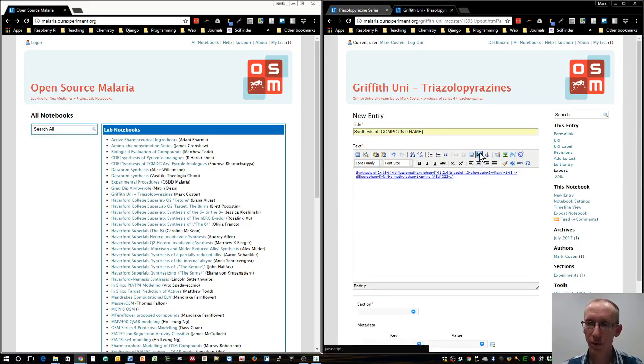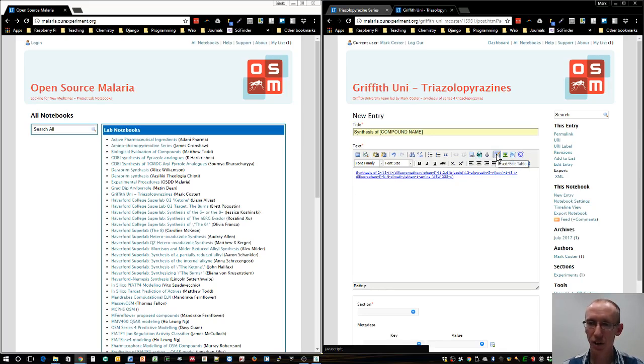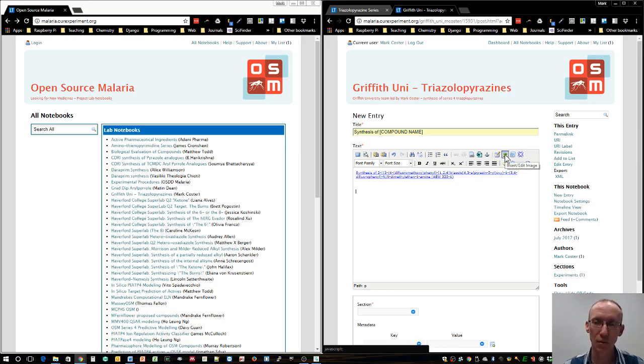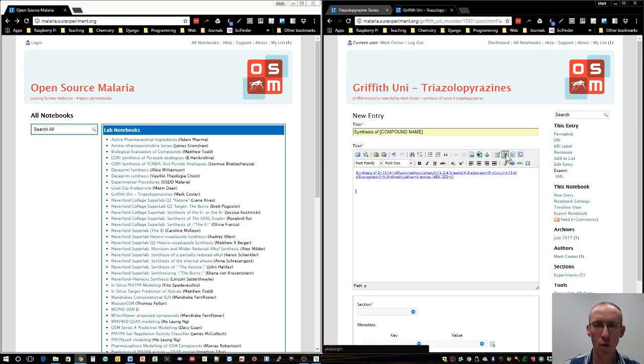You can also insert a data file embedded within your entry. You can insert a table, there's limited functionality here, and you can insert an image. Image is going to be really useful for the reaction scheme. However, it's not quite as straightforward as cutting and pasting.